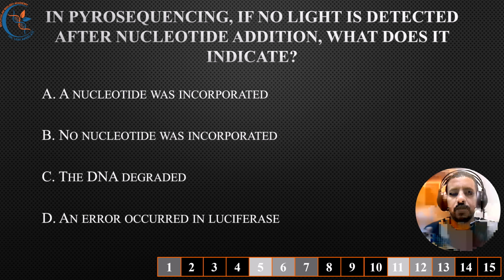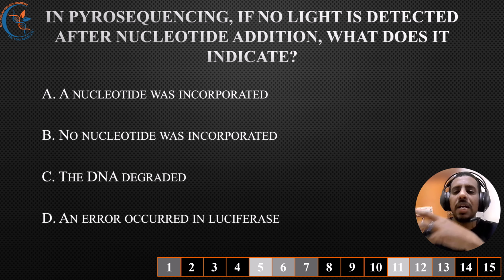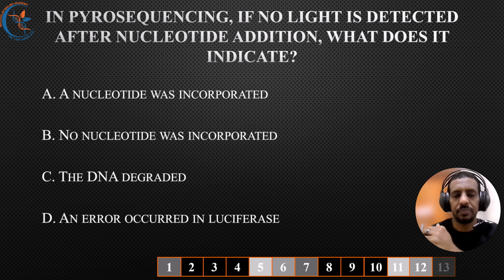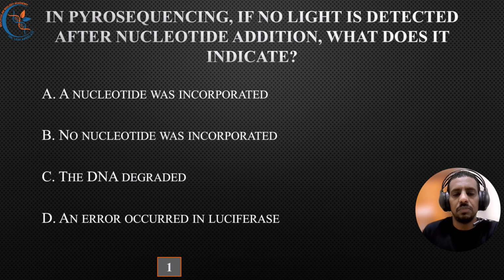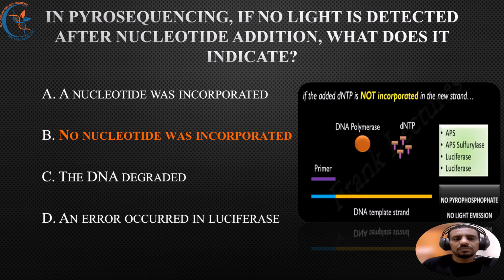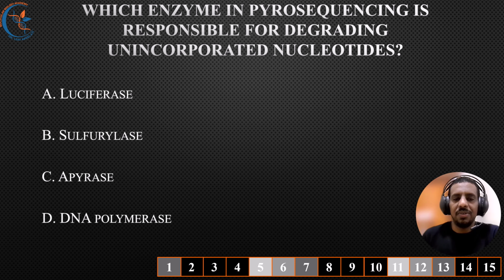In pyrosequencing, if no light is detected after nucleotide addition, what does it indicate? In pyrosequencing, the absence of light means that the added nucleotide did not match the template base. So no incorporation happened. The correct answer here is no nucleotide was incorporated. Okay, let's move on.